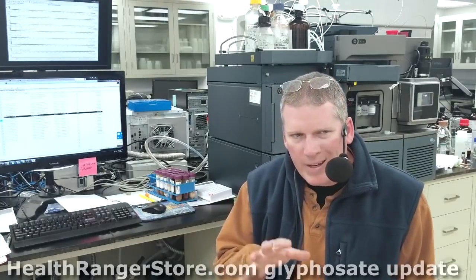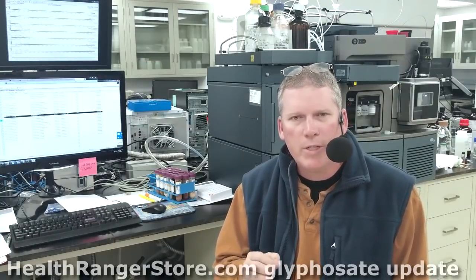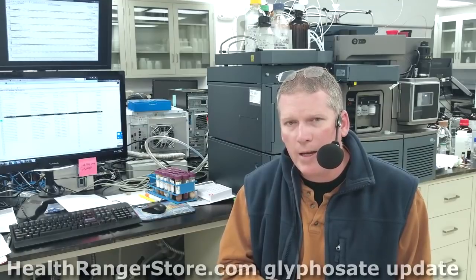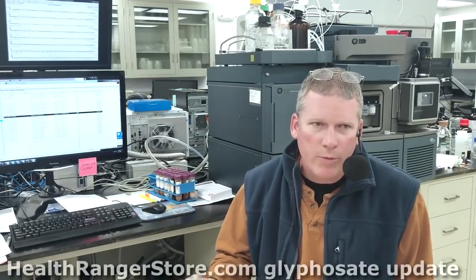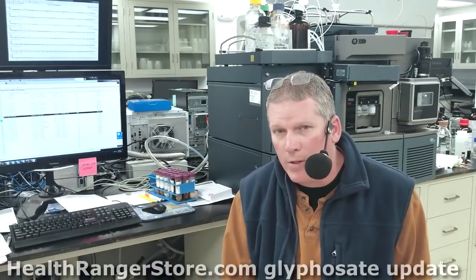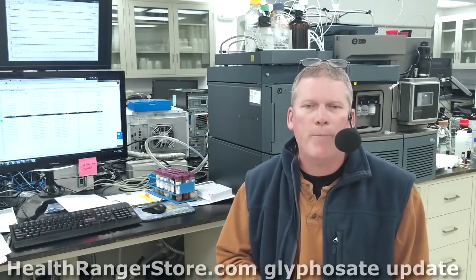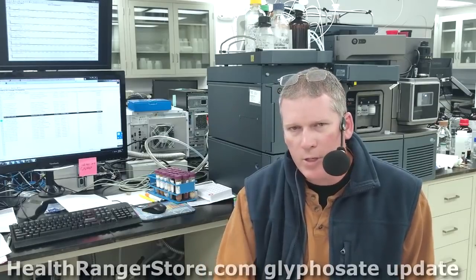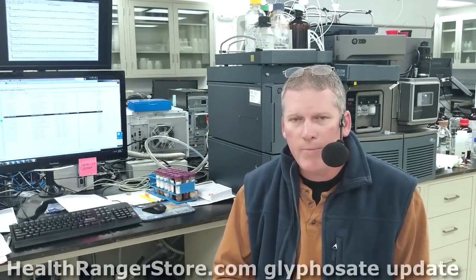Because of that, we have extremely high confidence in the consistency of the retention time, which is the elution time of the glyphosate analyte coming off the column. In our method, that happens to be 1.79 minutes. It's a fairly early eluter. So we know that we have retention time, we have the parent mass, we have the daughter mass, and we have the confirmation ion, the fragment ion.